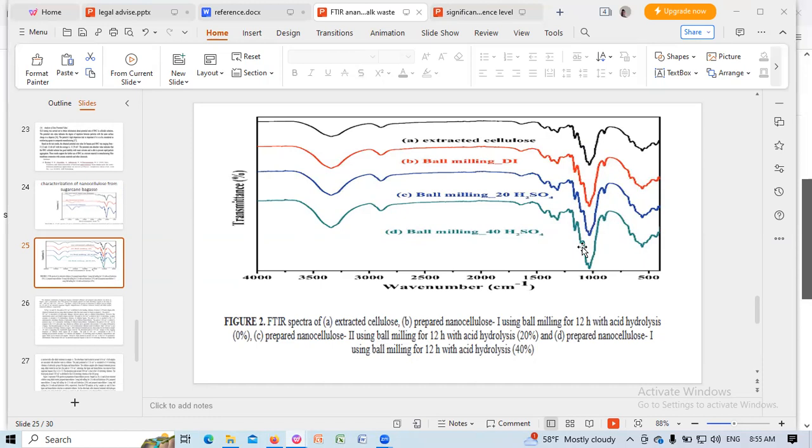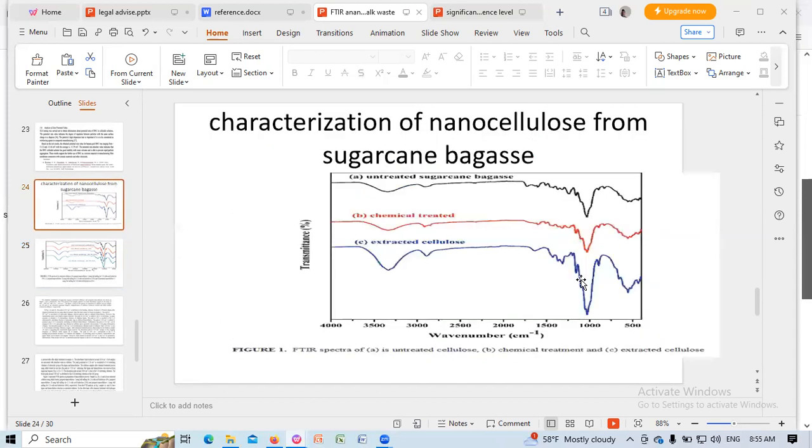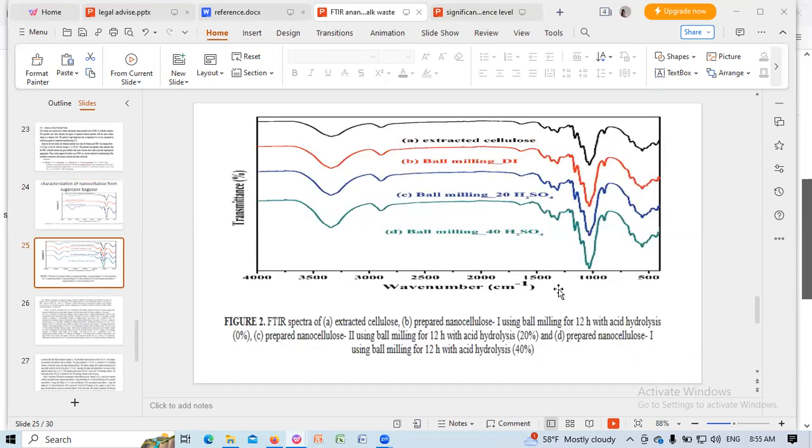In another peak, we see in the similar area, 1051 per cm, due to CO anti-symmetric stretching vibration of glycosidic ring vibration in cellulose and aromatic CH plane deformation of lignin. 1100 per cm is due to OH deformation of cellulose, OH deformation in the area 1100.